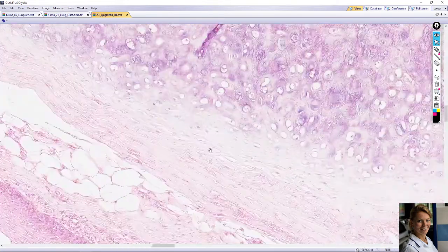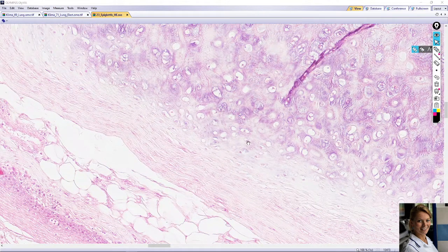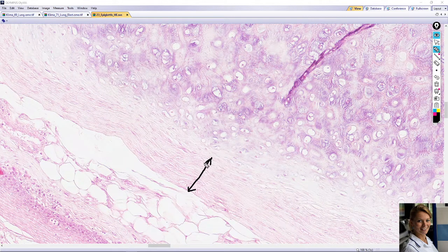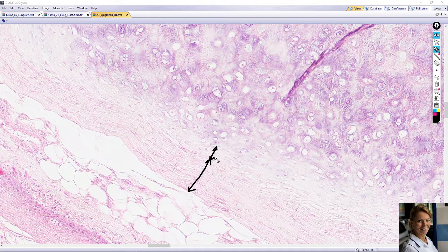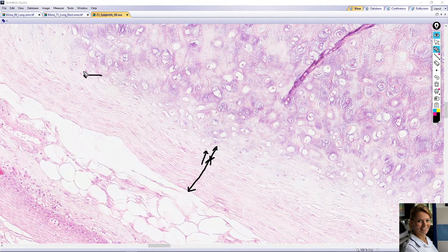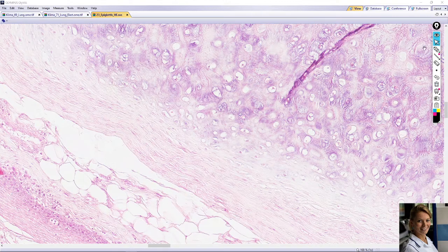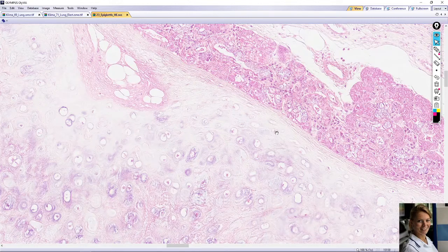The perichondrium has two layers: a fibrogenic layer approximately here, which contains fibroblasts, collagen fibers type one, blood vessels, and nerves; and a chondrogenic layer of the perichondrium, which contains chondroblasts — for example here, also here, and here. On the other side as well, chondroblasts are found in the chondrogenic layer, and here is the fibrogenic layer of the perichondrium.